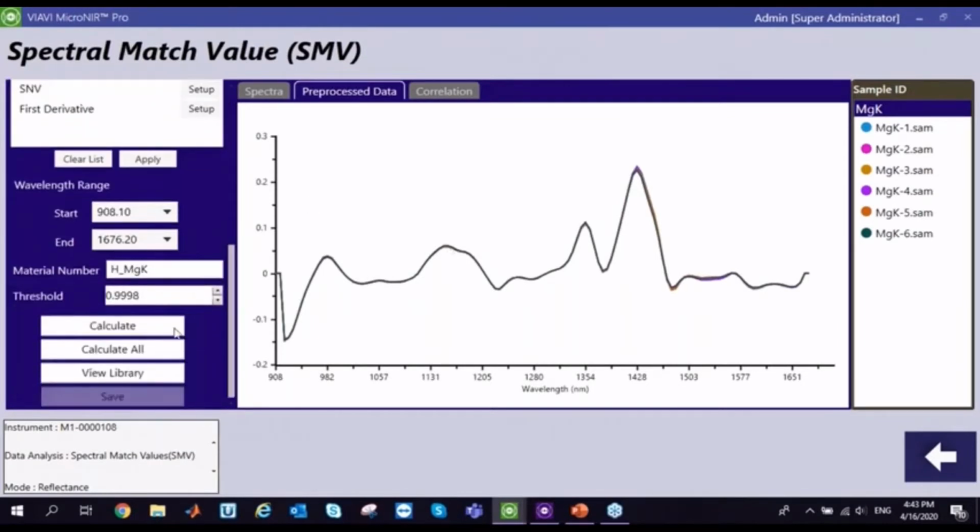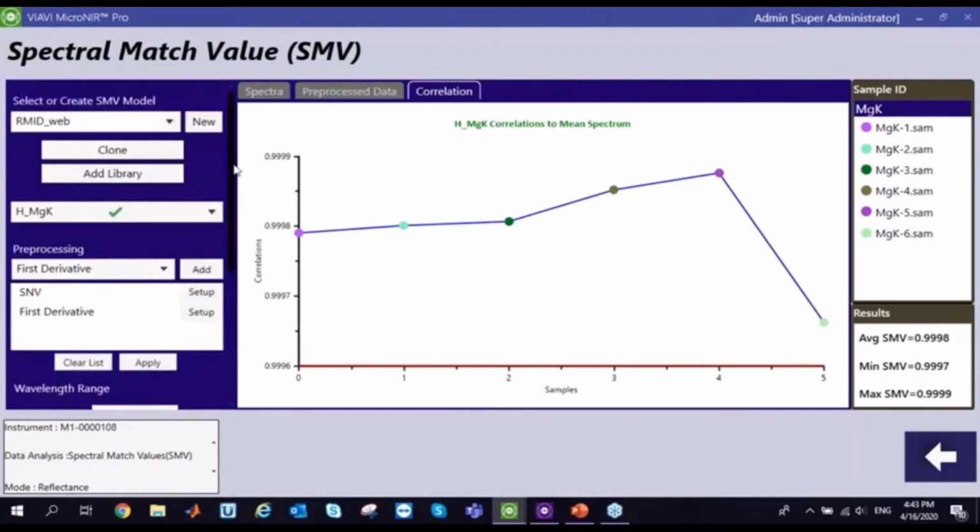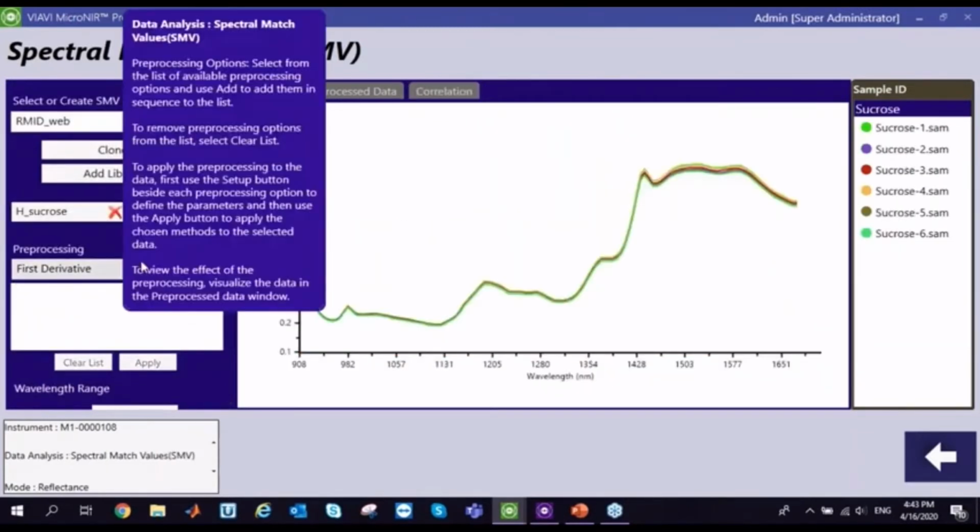Then I go down, I calculate my model, and again, you can see that I have 2 dots that are in the wrong part of the boundary because the boundary is fixed. It's on default and we have to modify it to include all the dots. Perfect. Now all the dots are included. I define my boundaries and I can move to the last library, that is the sucrose.